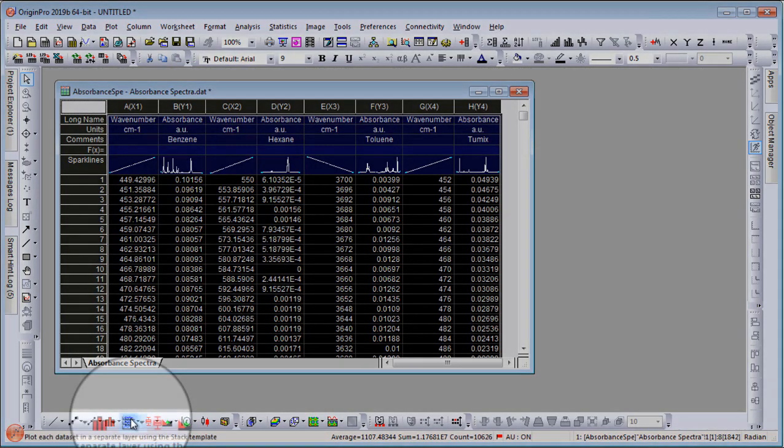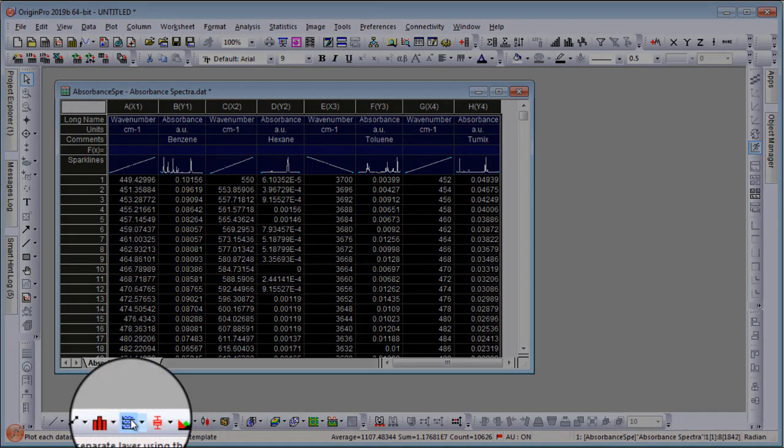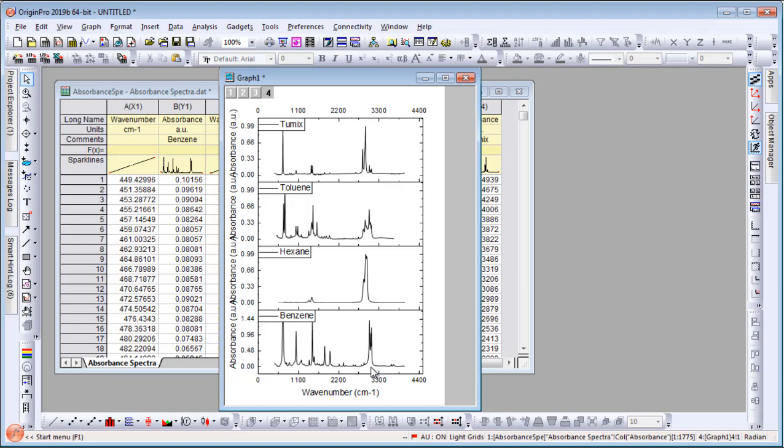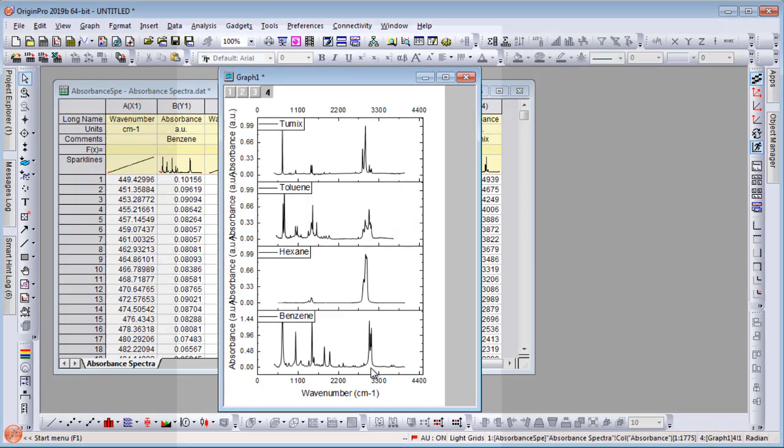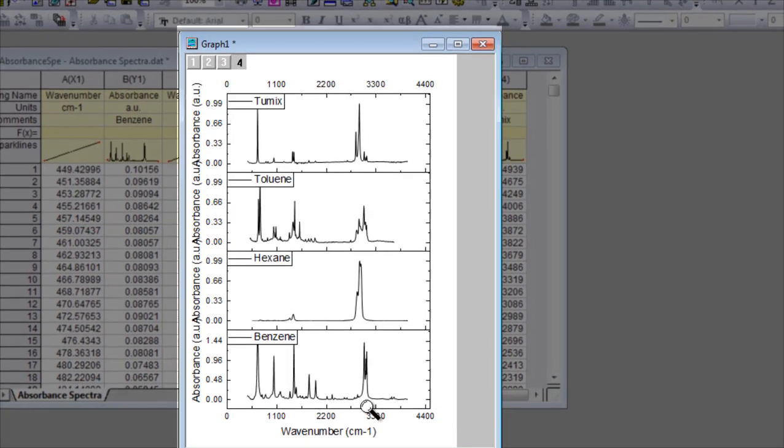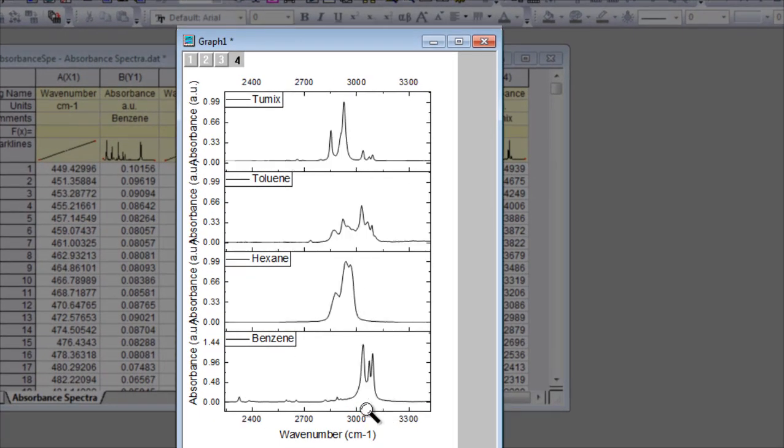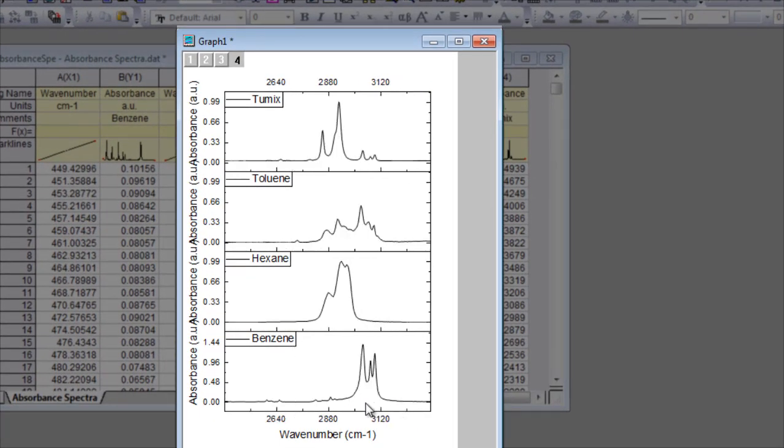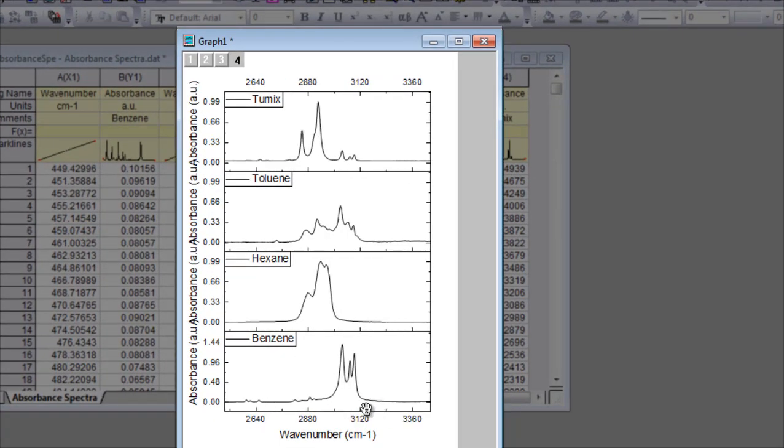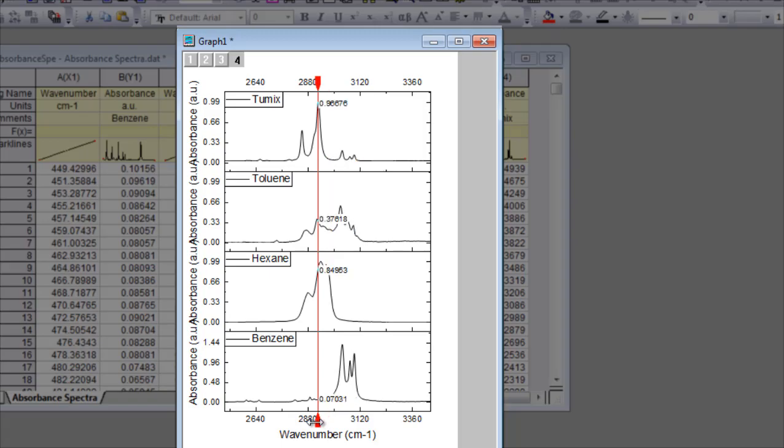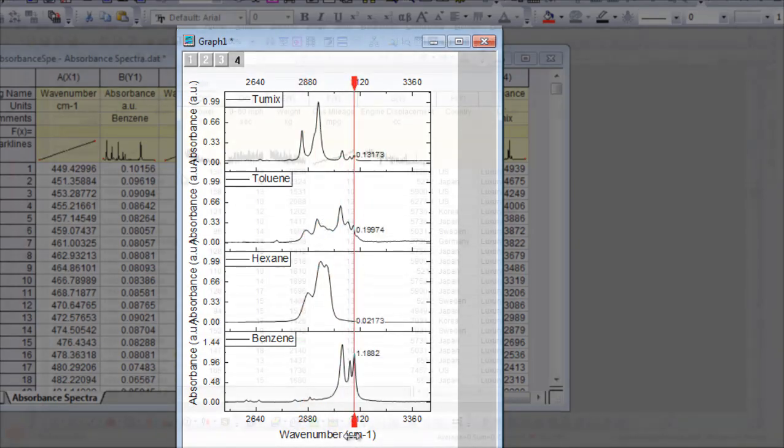Then, simply select the entire worksheet and click the desired plot button to create a graph. Zoom and pan into the axis scales to interactively explore your data. Use tools such as a vertical cursor to read values.